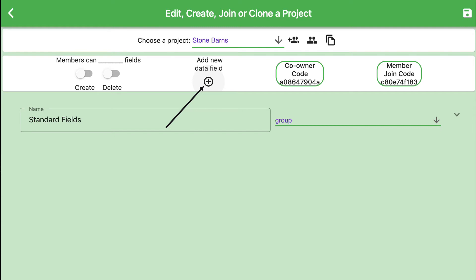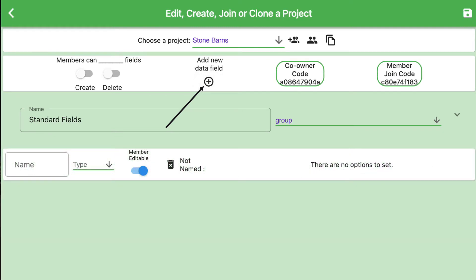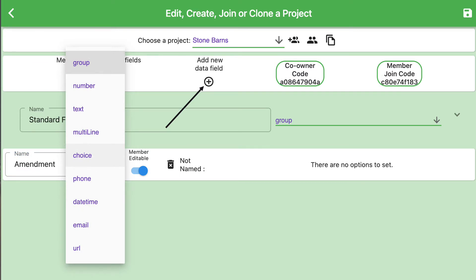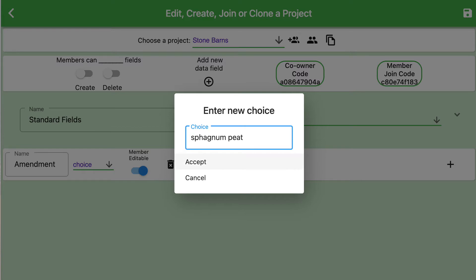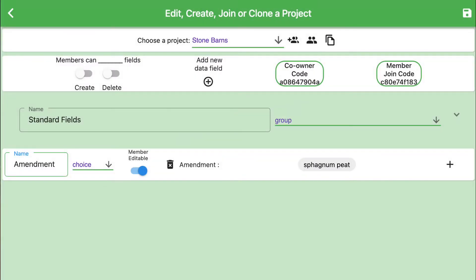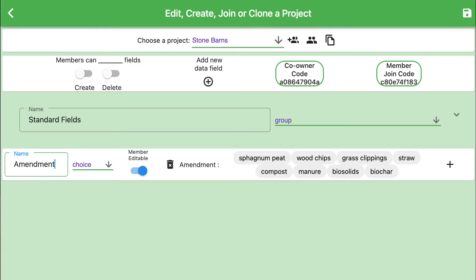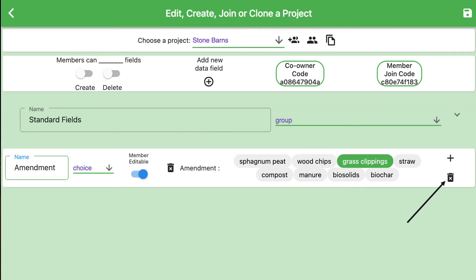We click add new data field and a new field appears. We can then give the field a new name and choose a type. We want this to be a choice field where the users will select from a predefined group of choices that are perhaps project dependent. Click the plus icon to enter a new choice. After entering the name, hit enter or press accept to create the new choice. Repeat this process to generate several choices for your project members. To delete a choice, select it and then press the delete icon.